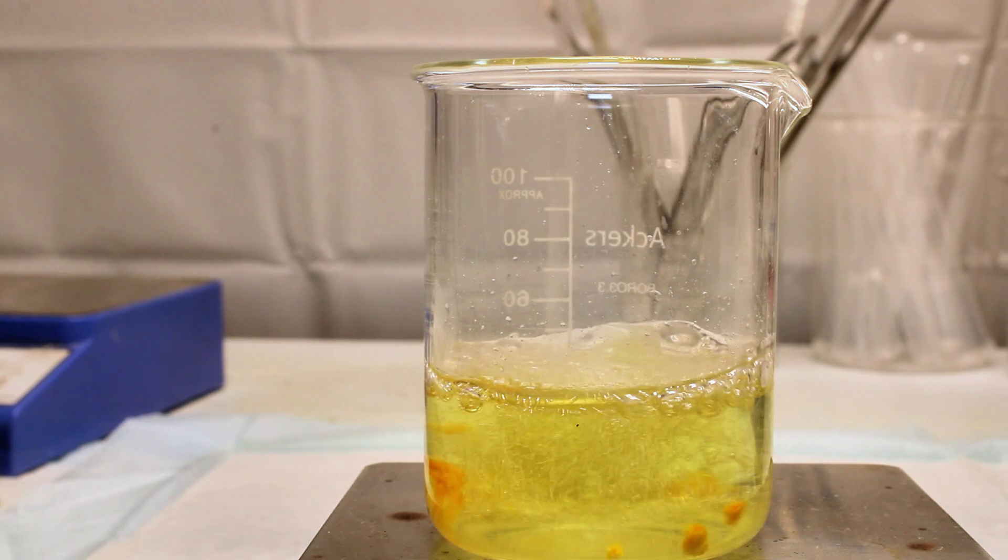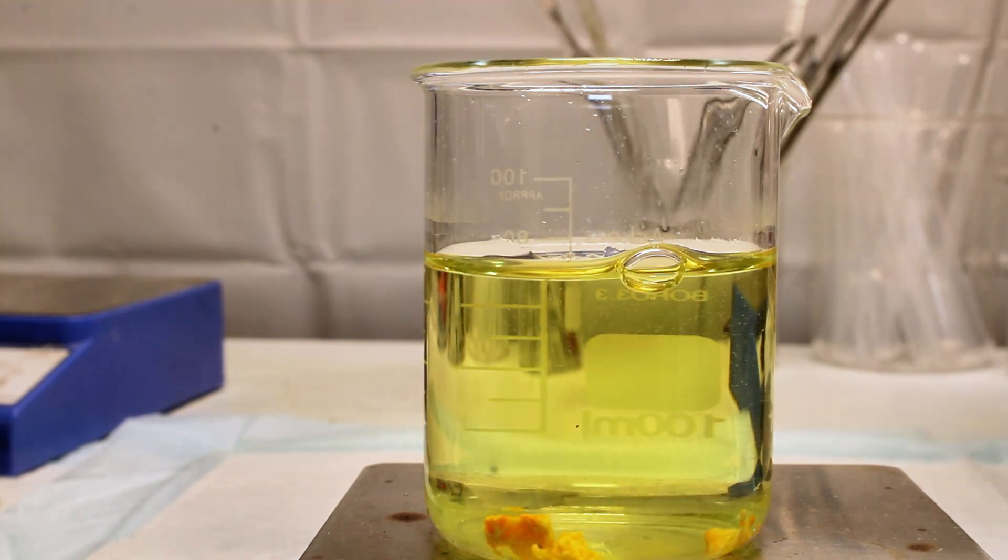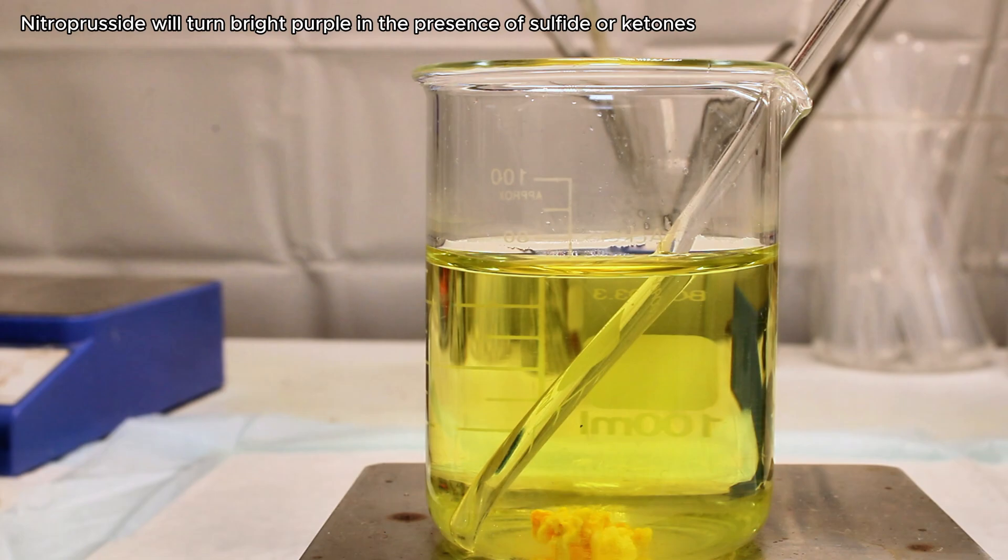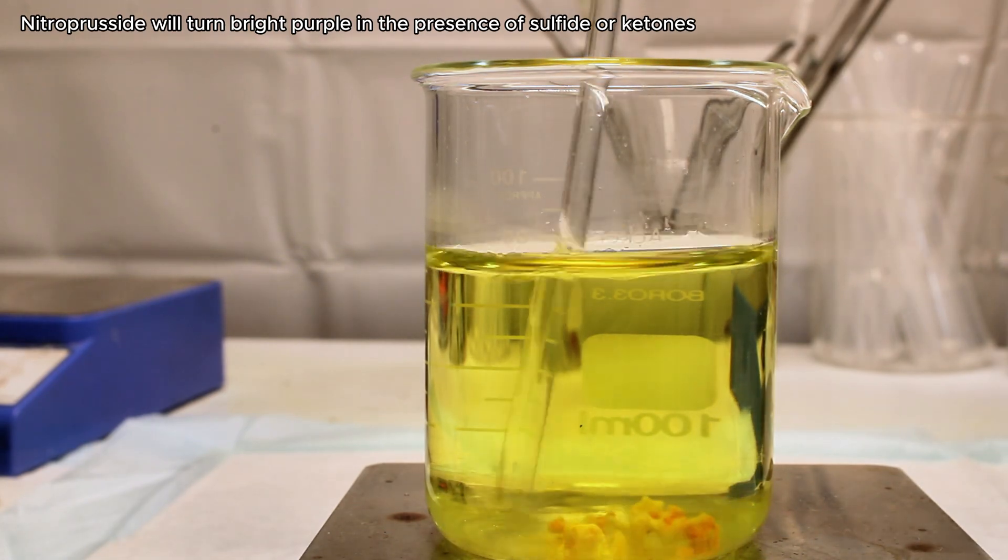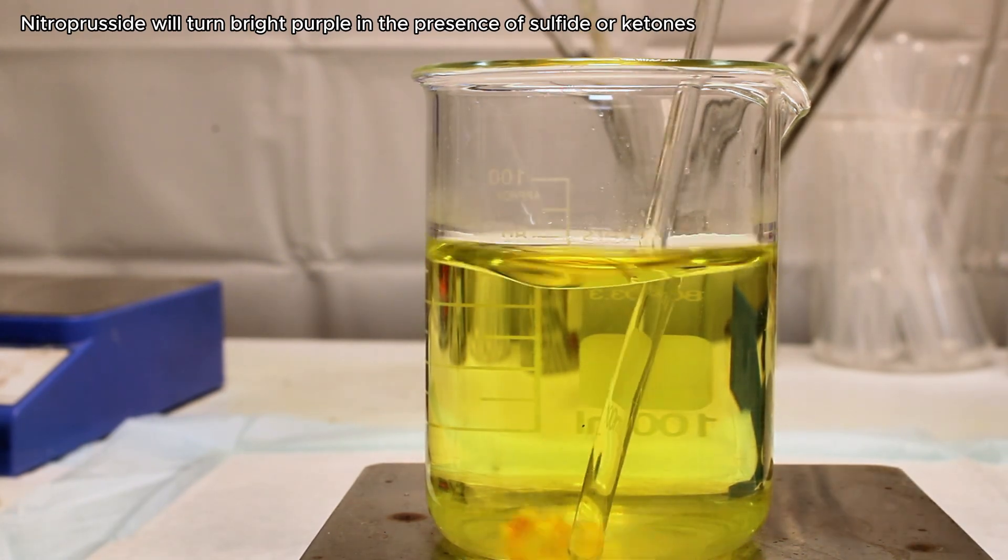One more use of sodium nitroprusside I didn't mention earlier is that it can be used to detect the presence of sulfide ions or ketones. In both cases, it turns purple, and for my first demo, I simply dissolved some of the sodium sulfide I made a few months ago in some distilled water.